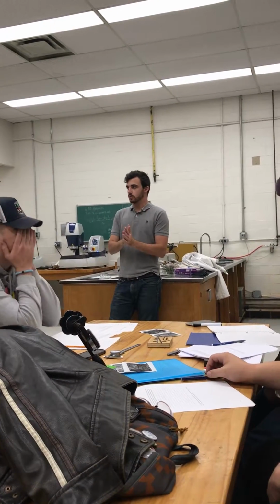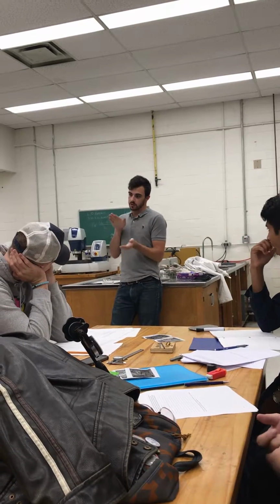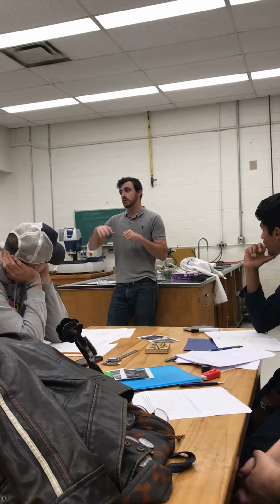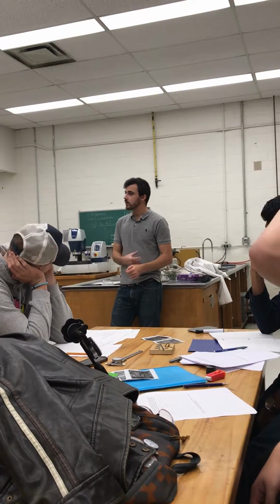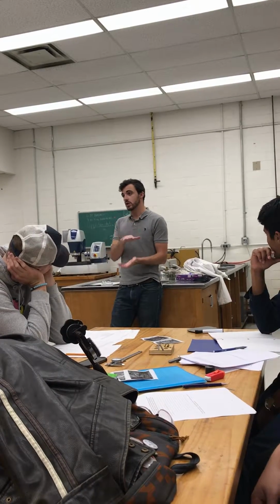So, cold rolled steels, basically what happens is you have compression rollers. You put the sample in and it rolls it through. There should be a really pretty diagram in the lab manual that explains exactly what's happening to that grain structure. So you're compressing your sample, okay? This causes cold working, which allows for higher strength of the surface. On top of that, it's also going to change the dimensions of the surface, okay?